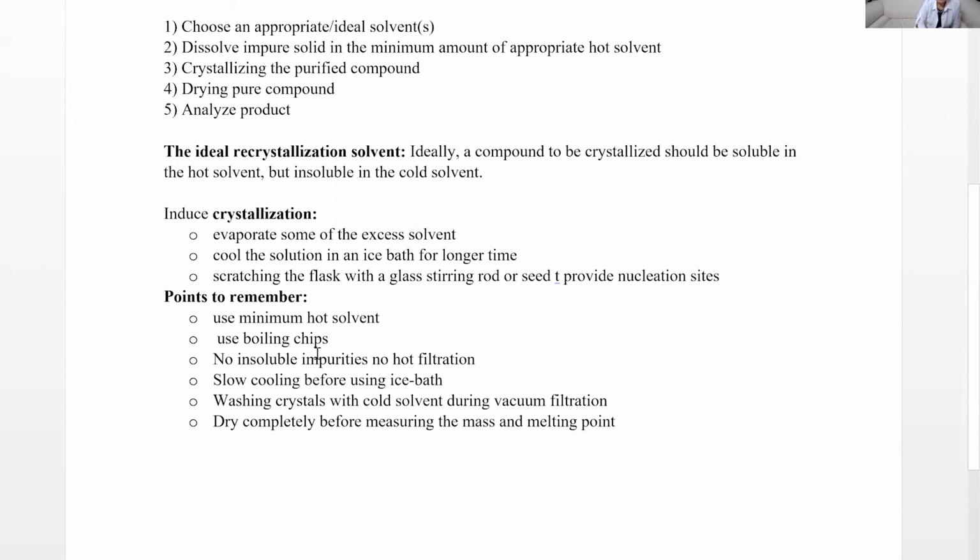If there are no insoluble impurities, you don't have to do hot filtration, because if you do hot filtration, most likely you're going to lose some of the product. And if there are insoluble impurities, that means the solution is boiling or near boiling, and there are still solid particles in there. That means they are not going to dissolve. And remember, you should not try to dissolve the boiling chips. Boiling chips are boiling stones. They're not going to dissolve. So don't work too hard for that. And if there are no insoluble impurities other than the boiling chips, no hot filtration.